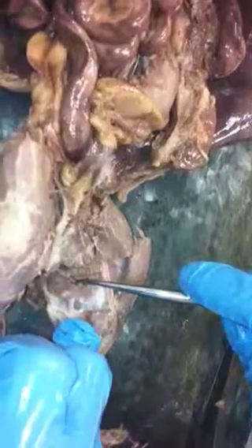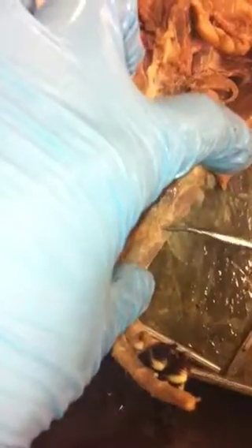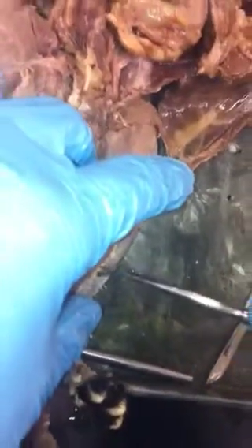Semimembranosus. Gracilis cut. This right here. We didn't cut it, but if you cut this right here, if this is cut, you have a gracilis cut right here. So it says cut, so I don't know where to cut it. The gracilis cut? You're too far down. Right here? No, it's above there. So this we only did to here.